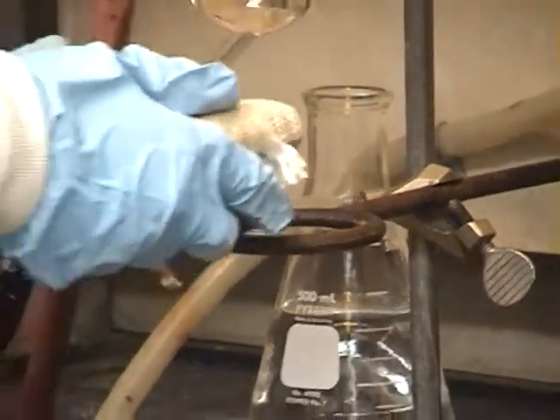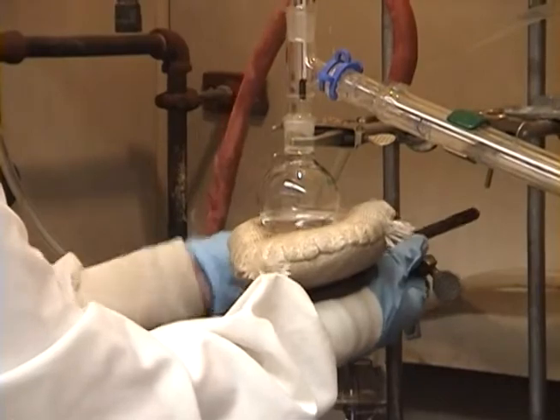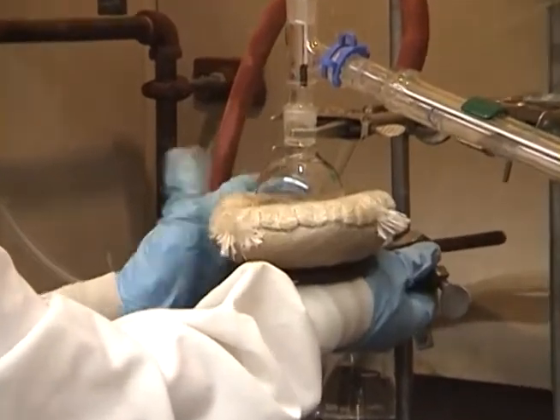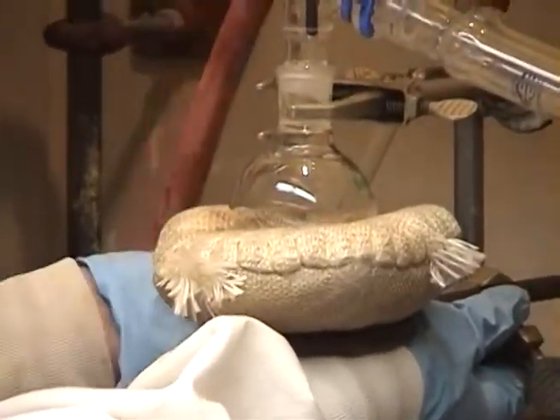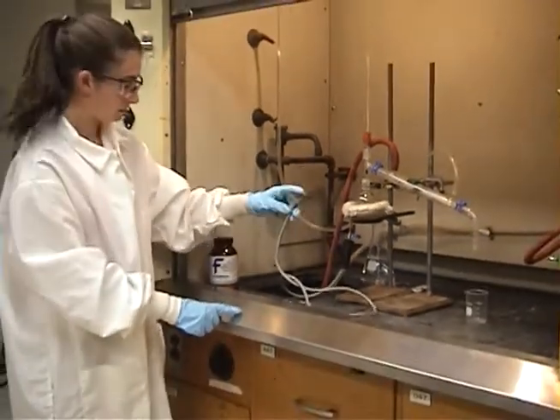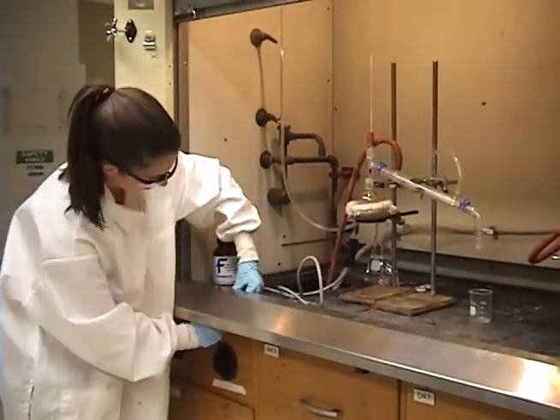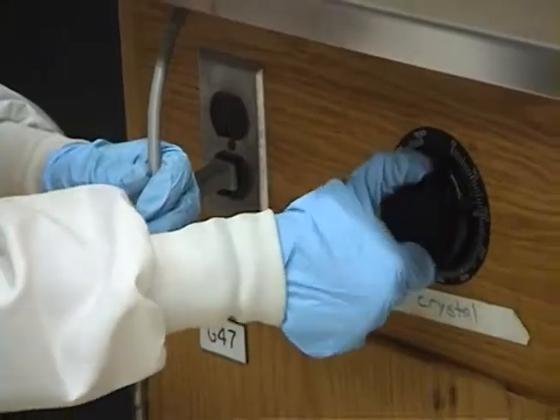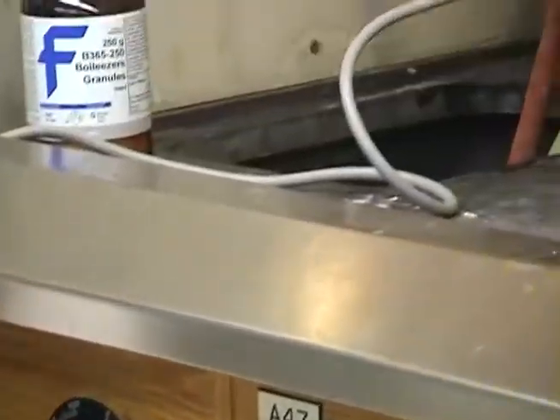An iron ring is used to support the heating mantle, which is moved upward to snugly cup the round bottom flask. The cord of the heating mantle is tucked under the ledge of the hood and then plugged into the outlet under the ledge, where it can be controlled by the variac dial.